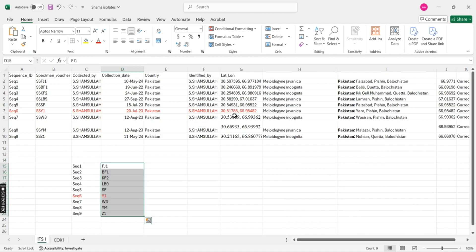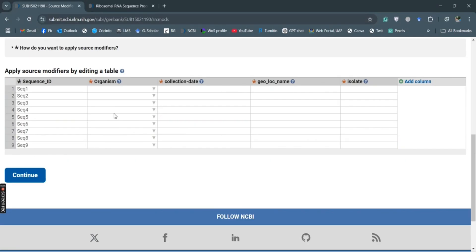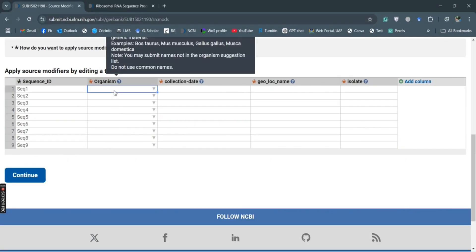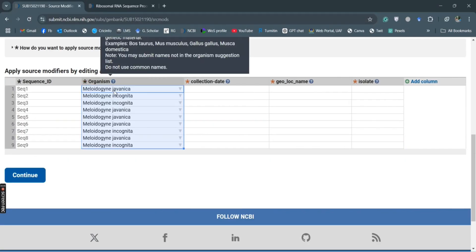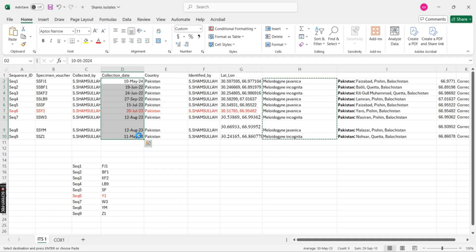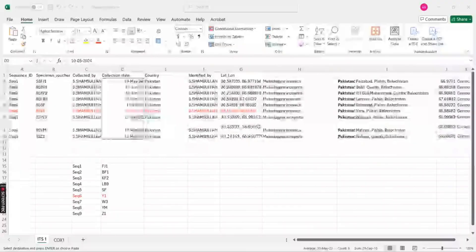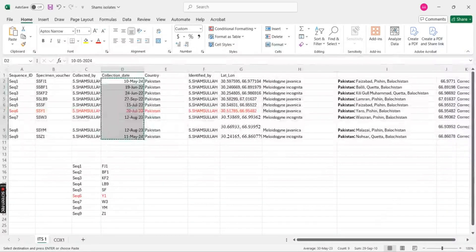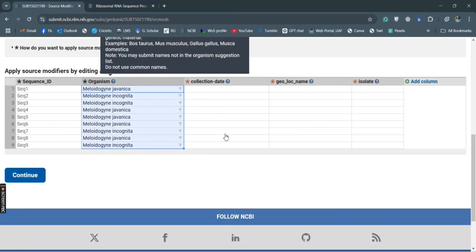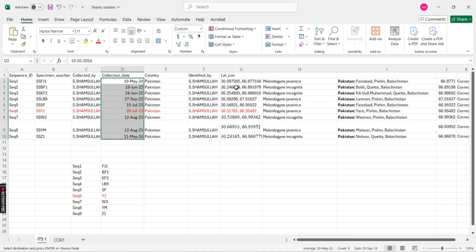Here we'll put this data over there, and then we have the collection date. We'll put the data for the collection date. And then the location, so this is the location.